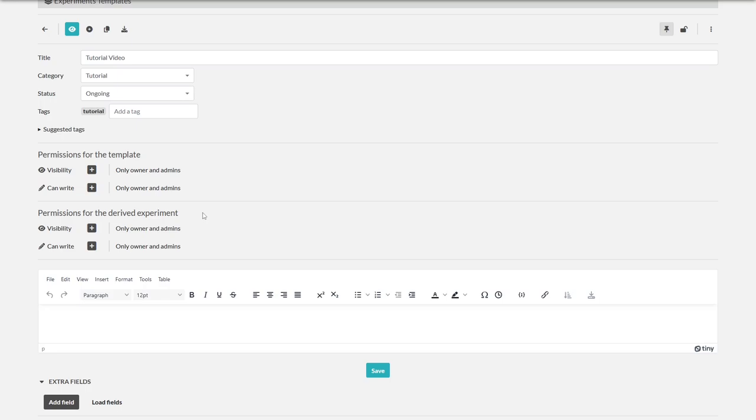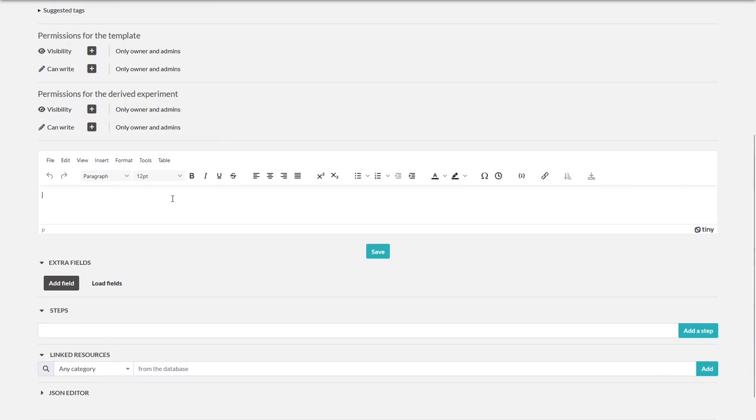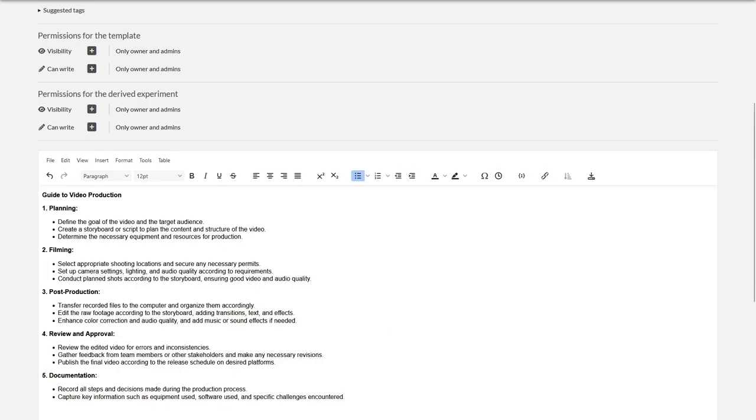In the template you can also insert additional information. In our case, this might include instructions on how to proceed when producing a video. So people who use this template already have an instruction in their notebook entry.